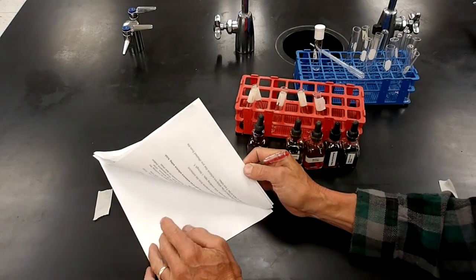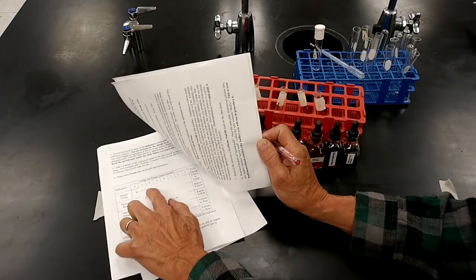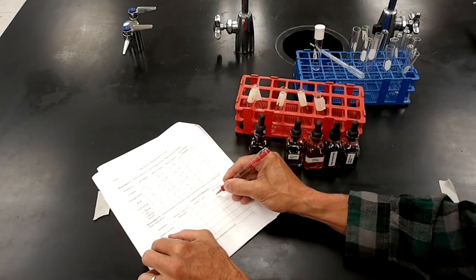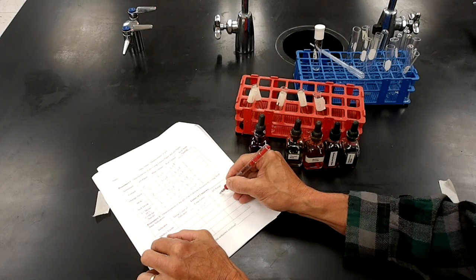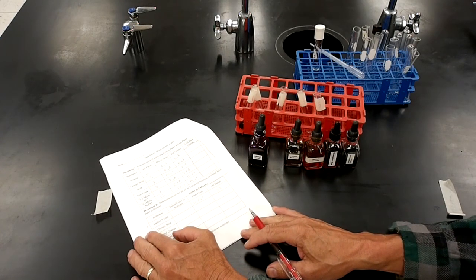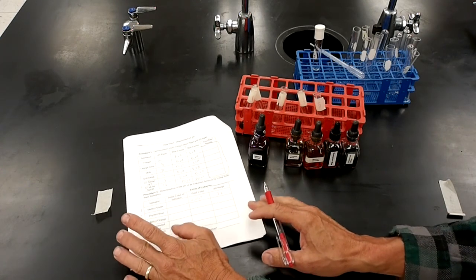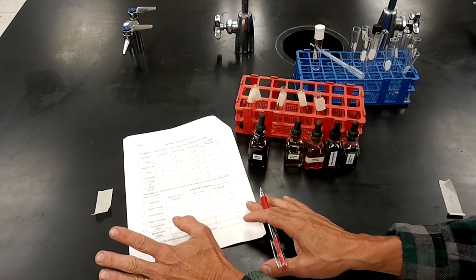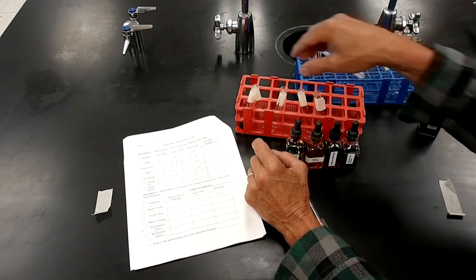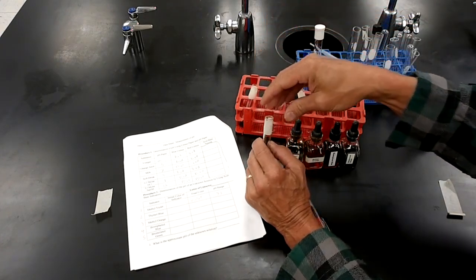So what's the pH range? Well, if I go back and look at that, all I can tell is the pH is greater than 2. So the pH right now I know isn't 1, isn't 0, but it could be 3, 4, 5, 6, 7, and so on. I know it's above 2. That's all I know. So that's it for the methyl violet. Then we do the same thing, tube number 2.